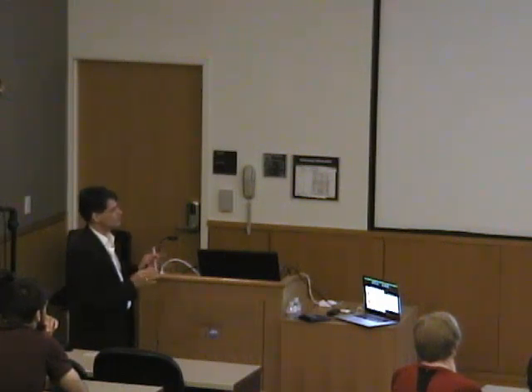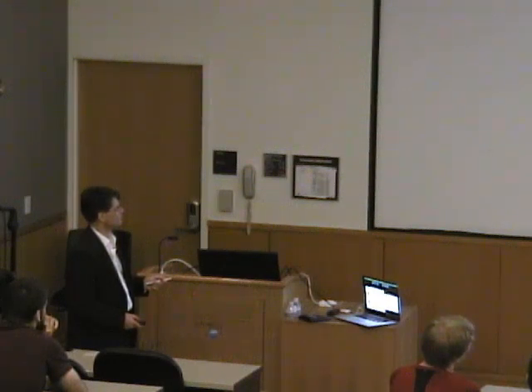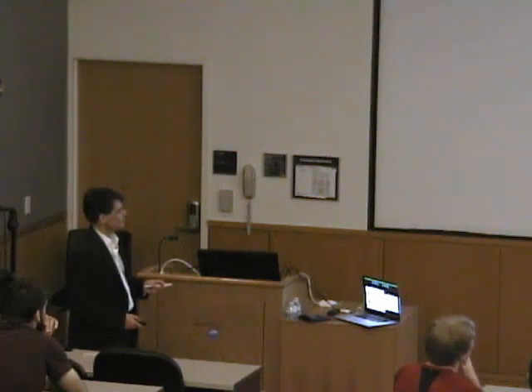This slide is an important slide because it puts into perspective what is happening. Here we have the electronic ground state multiplet. It has a total spin S, and it has 2S plus 1 components, m sub s equals S all the way to minus S. If you put on a magnetic field, these magnetic sublevels will split, and you can observe transitions between these magnetic sublevels with EPR spectroscopy. That happens on the order of, say, 0 to 10 wave numbers.